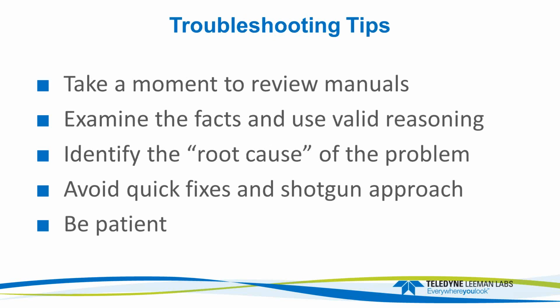Just before you dive into doing any troubleshooting, you should take a moment and review the manuals that you have. I mean, we're all the same. We only look at the manuals when we have a problem. But it's really helpful to have an understanding of what the system's doing. You want to understand how to operate, optimize and set up your sample introduction system. Look at the facts that are in front of you and use valid reasoning. Certain things that go wrong can't be caused by a nebulizer that's not running well. There are just certain types of things that don't follow. So you want to use valid reasoning so you're not wasting time.